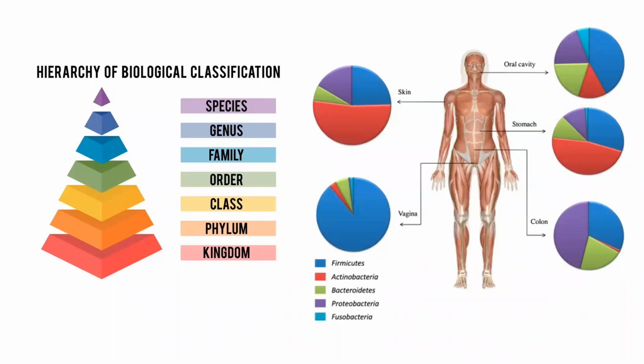Right? So now you understand that when we talk about metagenomic sequencing, we're actually talking about many different types of sequencing. We're talking about many different types of instruments, so at least several types of instruments. When we talk about different strategies to produce our data, we need to make a decision on which instrument is going to be used.